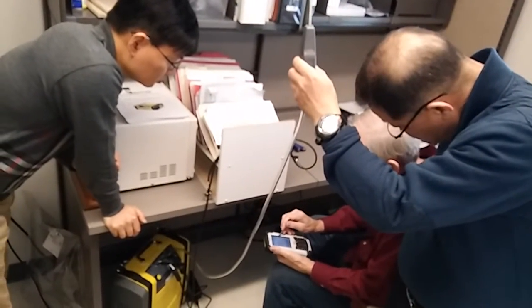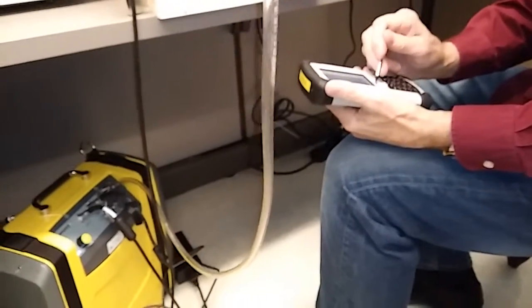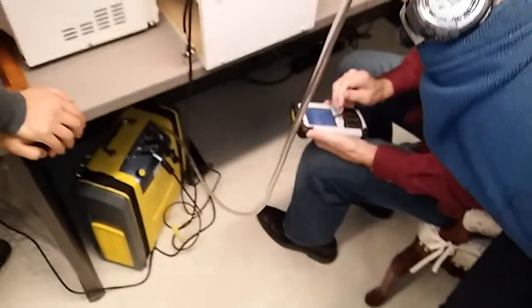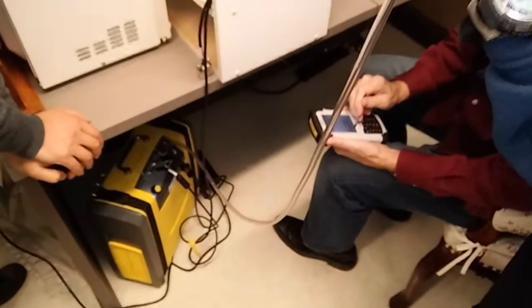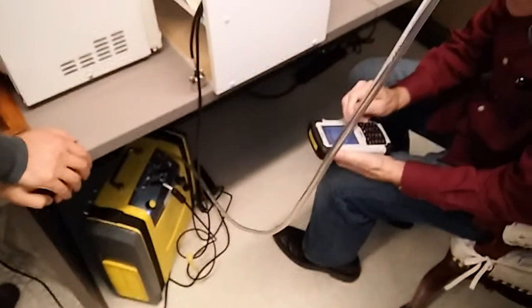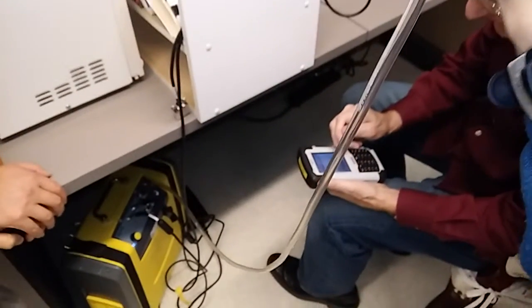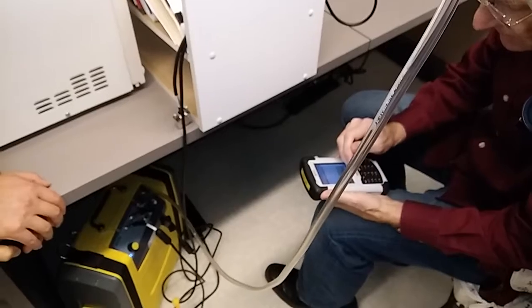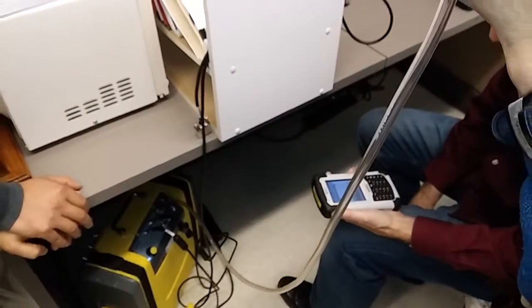Okay, let's see what we got. Got a problem here with carbon dioxide. It's still only 0.06. So, I have a problem. There we go.